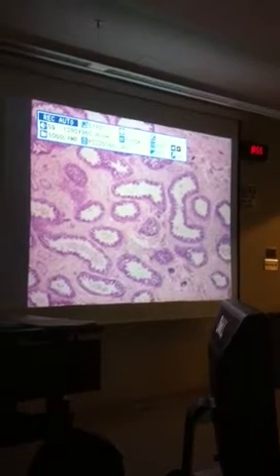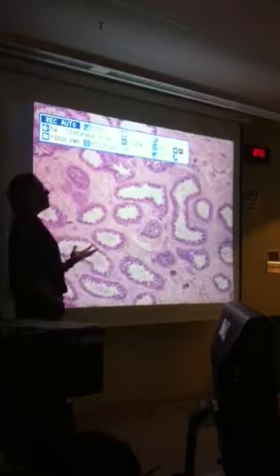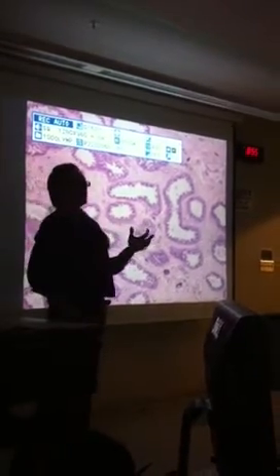Generally, you're going to find more sperm in the epididymis than you would in the testes, because sperm go to the epididymis to mature and hang out and wait. Chances are you will see some sperm in the testes as well, but you're going to see just sperm that are being released, traveling through the testes to get here.